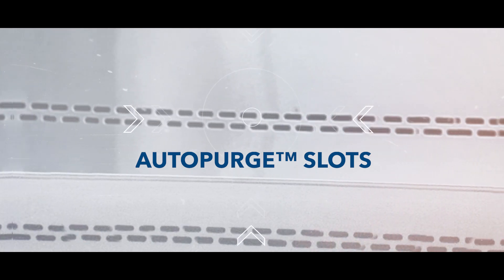The auto purge slots eliminate air turbulence and possible dead air corners in the work zone, giving more stability in the airflow.